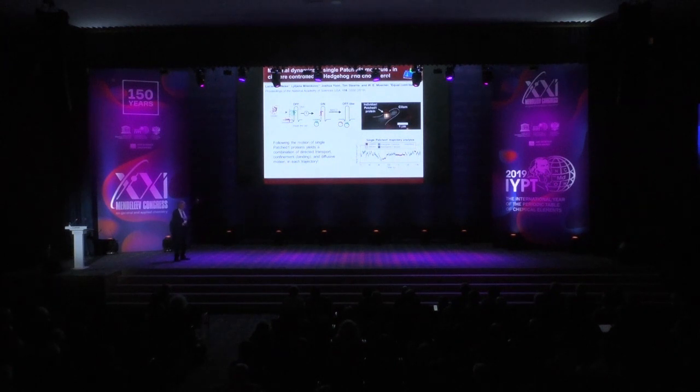So on the right, I'm showing you that we can image a single molecule. In this case, we're talking about this one that's green on the left. It's called Patched, and a single Patched in the cilium can be observed moving around and super-localizing its position. And at the bottom, I'm showing you its position as a function of time, where part of the time the motion is gray, which is diffusion, part of the time is directed motion in blue, part of the time is binding in red, because it's moving and finding partners and doing things. It's being pushed by motors sometimes, other times it's moving by diffusion. All of that is hidden in the motion of one molecule.